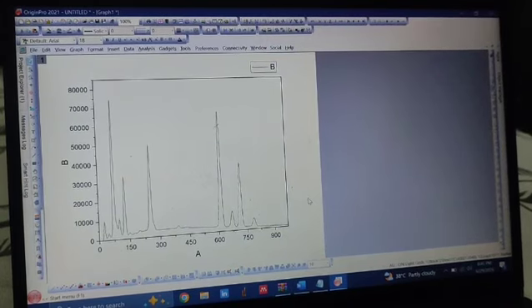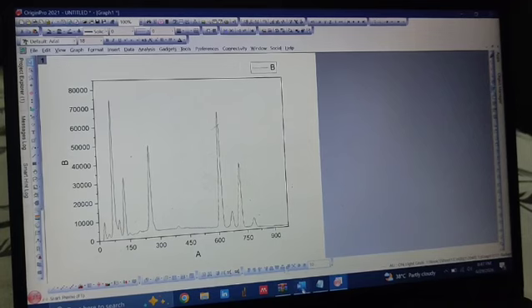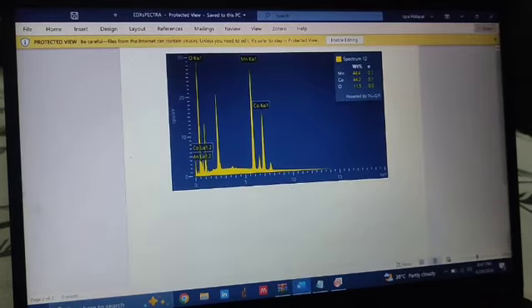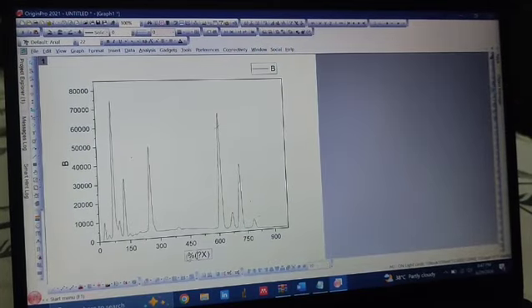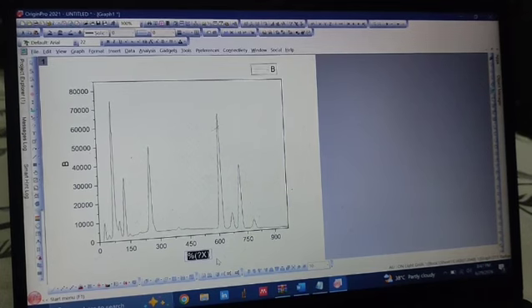Now we have to add axis labels. Go to the instrument generated graph to copy the correct labels. For the x-axis, it's energy kilo electron volt, and for the y-axis, it's CPS per electron volt. Update your axis title accordingly and make them bold for better presentation.